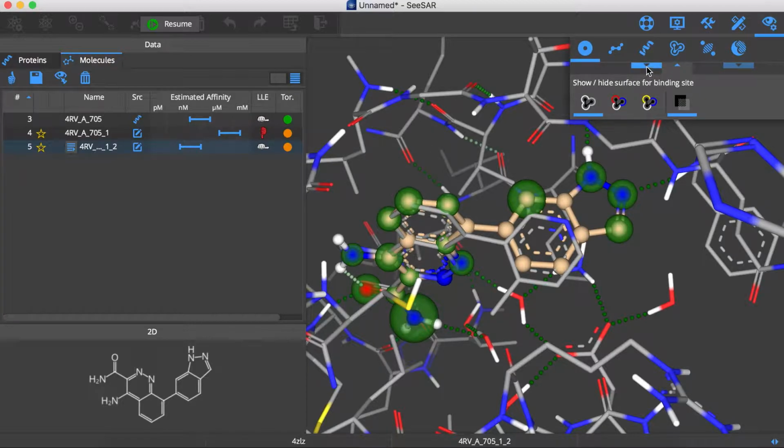We can visualize the water molecule here. The red dots are all the water molecules that have not been selected to participate in binding, but are present in the PDB structure. Water molecules that are considered conserved are explicit water molecules such as this one here.